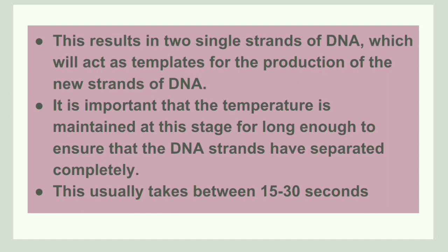The two single-stranded DNAs that we obtained act as templates. These are the templates for the production of new strands of DNA. Throughout the process, the temperature has to be maintained. This usually takes a time period of 15 to 30 seconds.